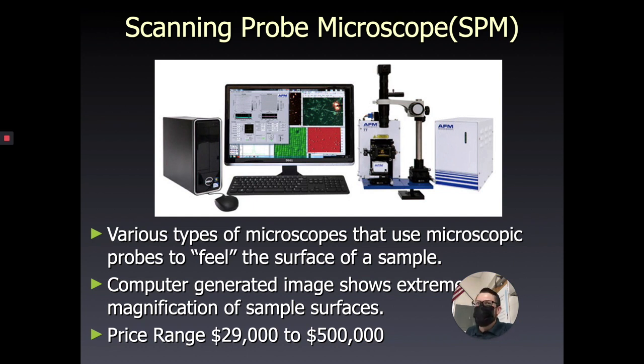If you go into the computer industry, whether it's making iPads or cell phones or computer chips, the circuitry now is getting so small that even typical magnifying glasses and microscopes are not able to see the size of the circuitry. So these are used very commonly in electronics manufacturing, because now we're dealing with circuitry that is extremely tiny. Depending on the type of model you use, these scanning probe microscopes can create extreme magnification of images, up to 1 million times magnification.